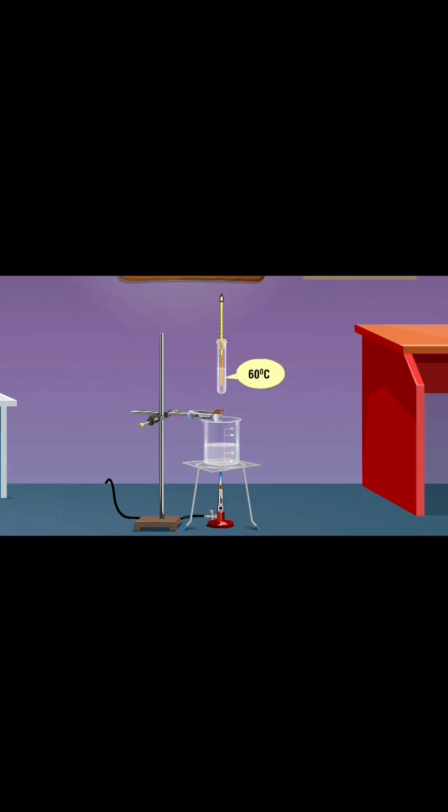Once this heating process has been done, you take this mixture and you pour it into a beaker containing sodium bicarbonate. The reason for this bicarbonate is to see that if excess ethanoic acid was present, it will react with sodium hydrogen carbonate.